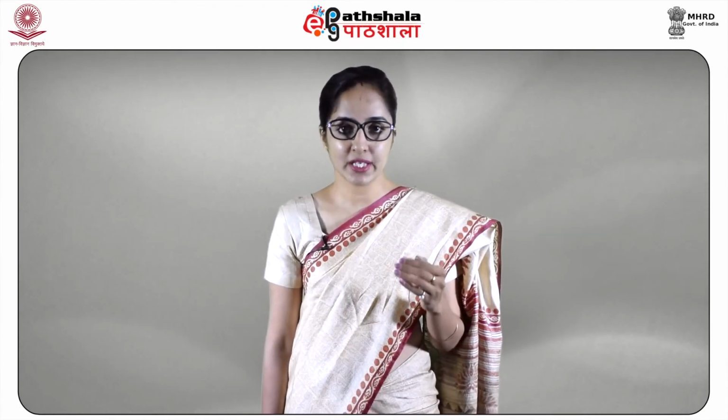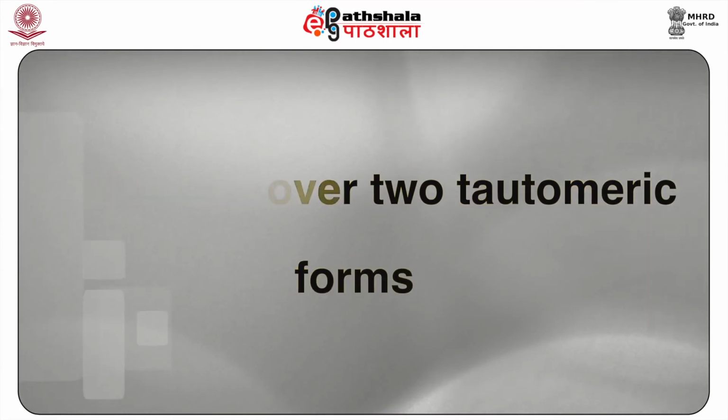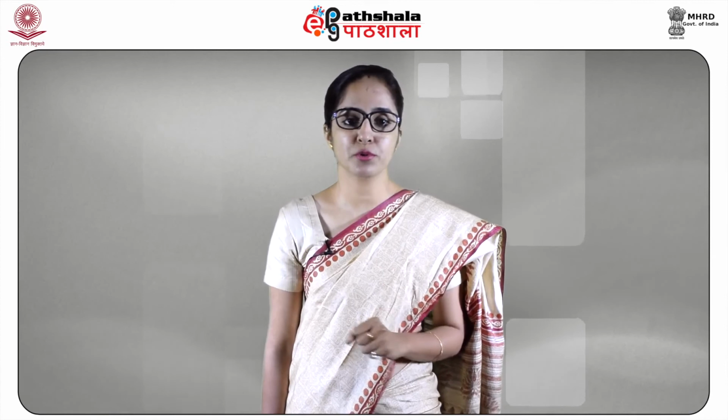The next application of UV visible spectroscopy is determining the preference between two tautomeric forms. If a molecule has two tautomeric forms, then the preference of one structure over the other can be detected by the use of UV visible spectroscopy.